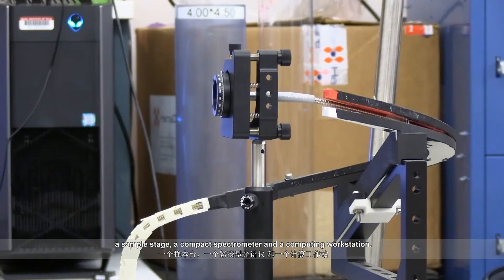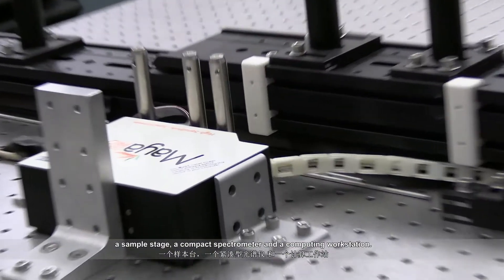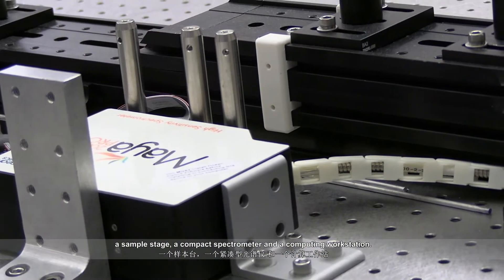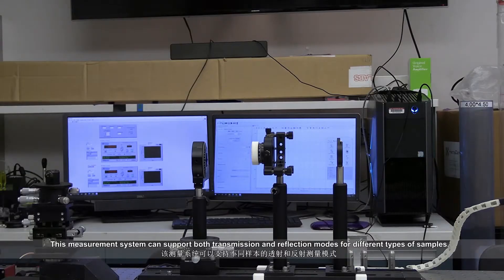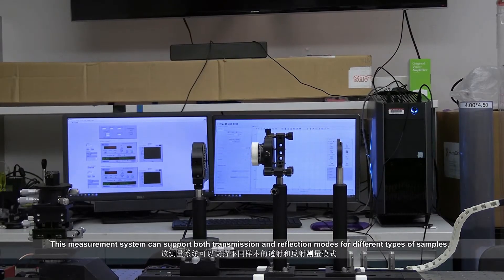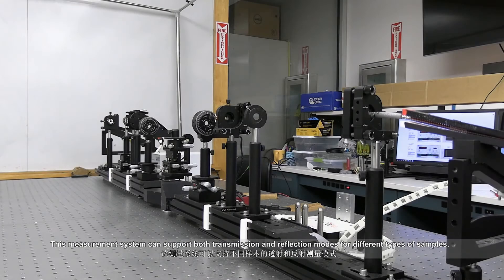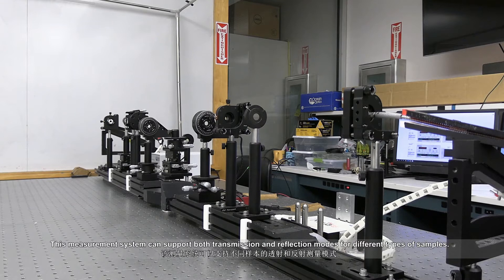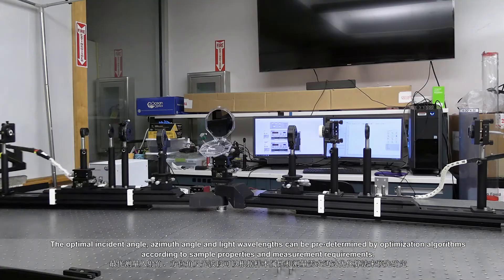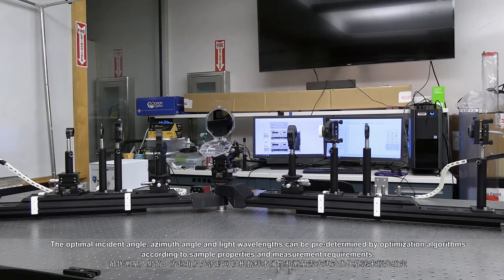It also includes a sample stage, a compact spectrometer and a computing workstation. This measurement system can support both transmission and reflection modes for different types of samples.